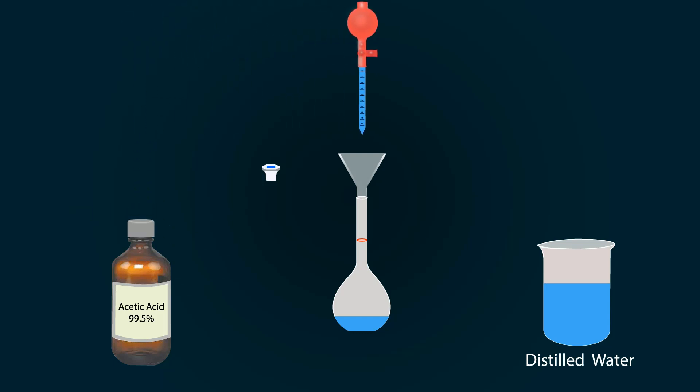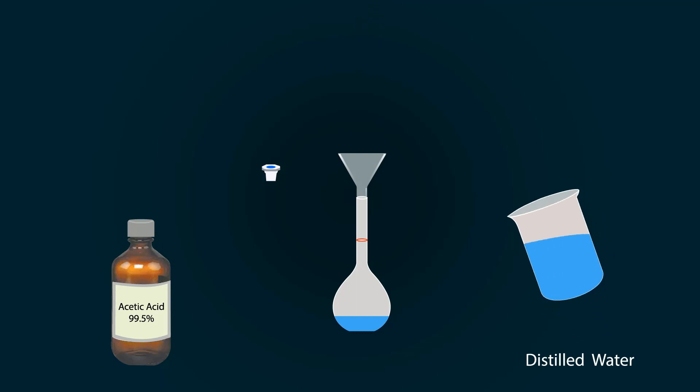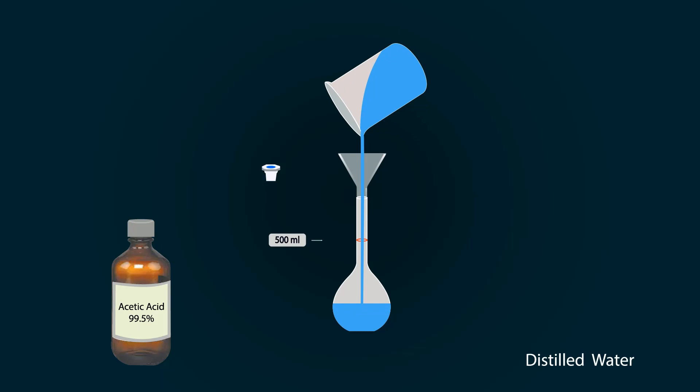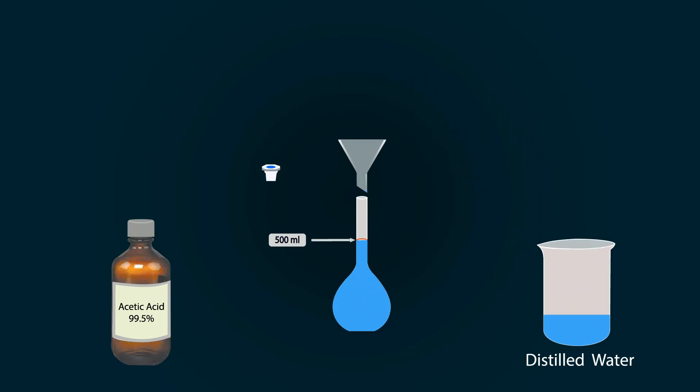and put into the volumetric flask drop wise so you can get precise measurement. Now please add more distilled water to reach it up to the mark which is 500 milliliters. You have successfully prepared one molar solution of acetic acid. You can store it in any bottle you want. Thank you.